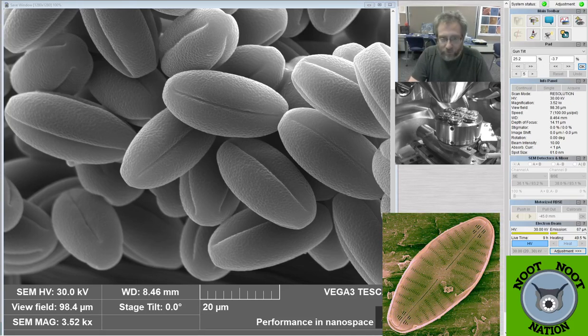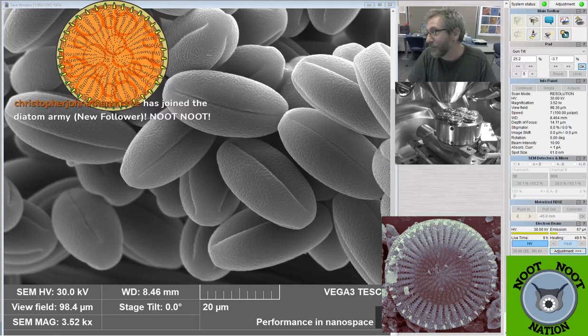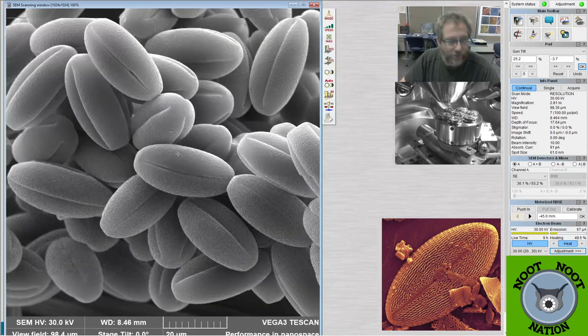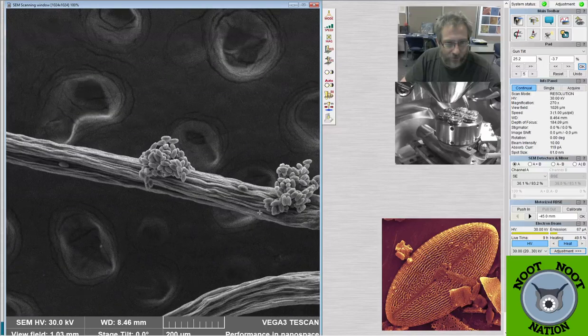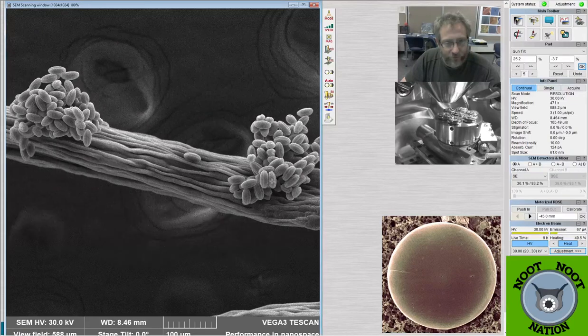This is Redbud pollen. I'm just marking it down so I know which one it is. And I've got my cheat sheet over there, whatever I put in the actual samples in the order that I put them in over there on the whiteboard. So it's helping me figure out what it was that I'm looking at again. So I'm just gonna put that in here so that when I document it, I know what I was looking at. And then I'm gonna zoom out and maybe get some images where you can see the plant as well.